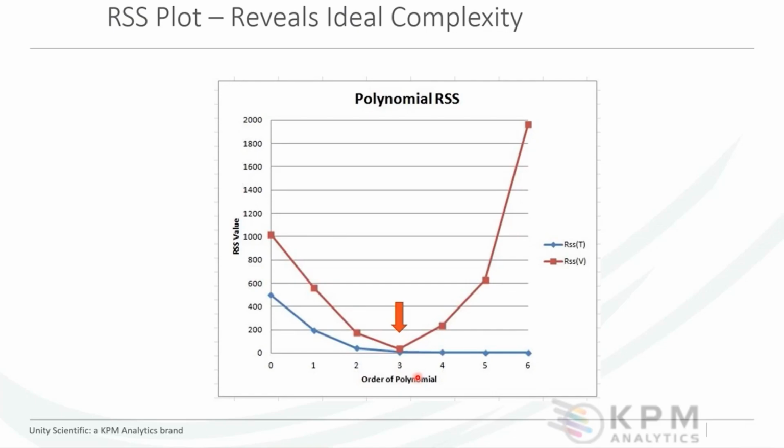This is just a short explanation of polynomials. It follows the same patterns as when we're doing factor-based mathematical reductions and factor-based regressions. Again, the only part of the software where we really use higher order equations is in the calibration transfer or instrument transfer section. But this illustrates that you want to use the lowest order calibration or instrument transfer equation you can, because as you start adding polynomial factors that do not relate to this relationship, your errors can increase very significantly.